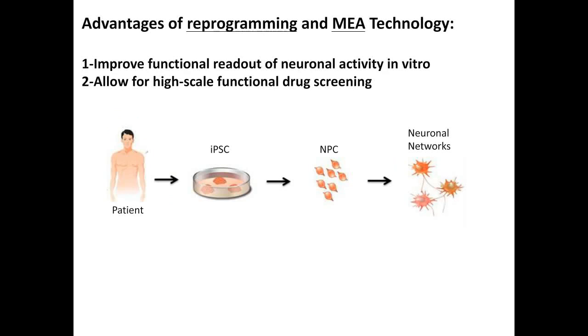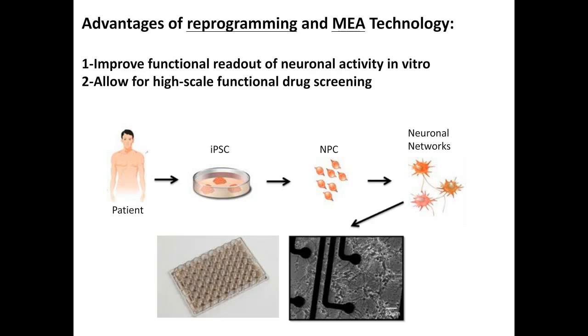So we have the current feeling that combining reprogramming technology with functional analysis provided by platforms such as the Axion multi-electrode array technology can provide additional information to the previous models described and potentially allow for better understanding of human neurological disease biology and potential discovery of new targets and even testable drugs in the future.